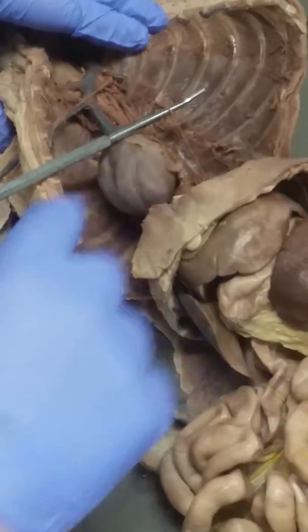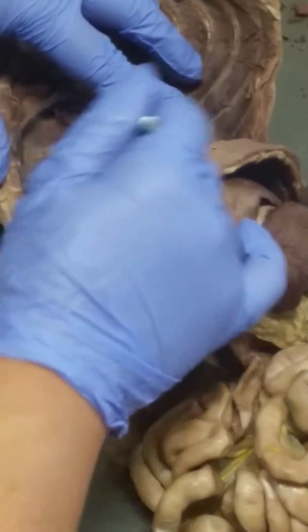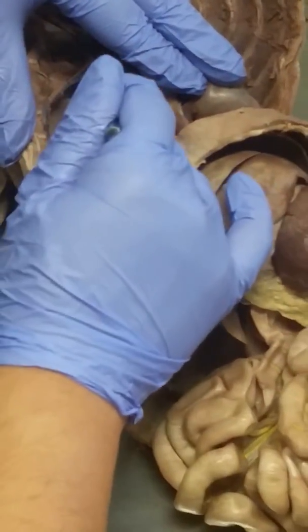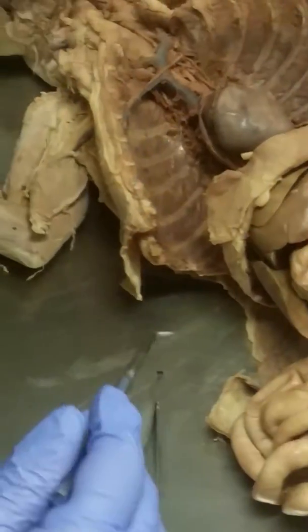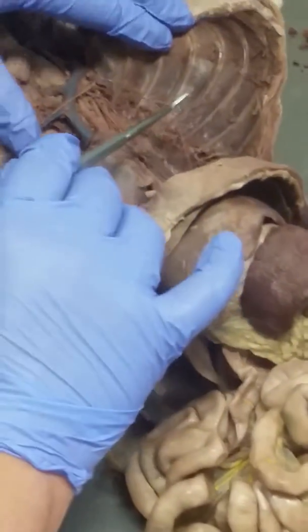The diaphragm's over here, right? You should have one on the left, and you should have one on the right. I haven't isolated the one on the right yet. I don't think I tore it. No, it's there. Yeah, it's here. I'll get that later. But here's an example of the phrenic, right?